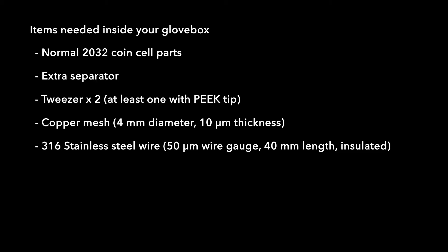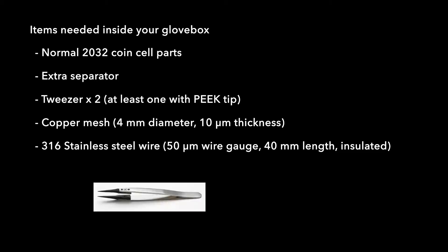You will need at least one more extra separator because we will be using a minimum of two or a maximum of four. You want to have a pair of tweezers, at least one with a tip that's hard plastic such as PEEK. It allows you to handle the lithium metal more delicately because the tip doesn't stick to lithium.